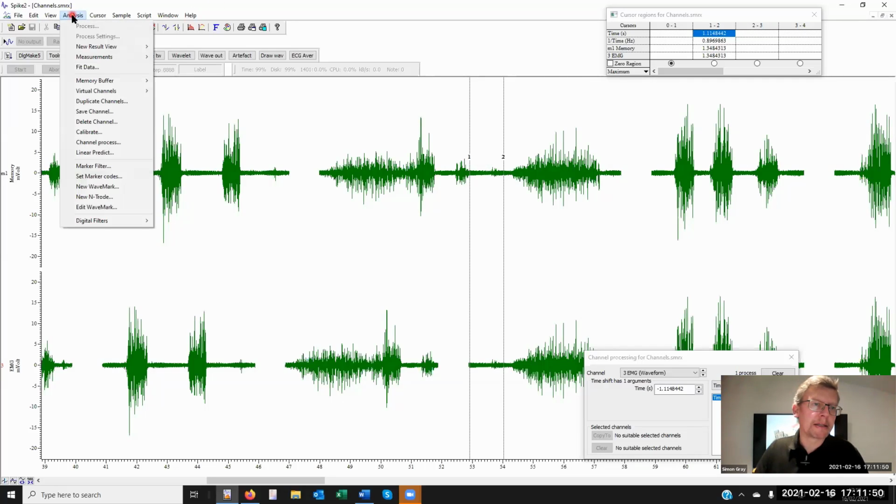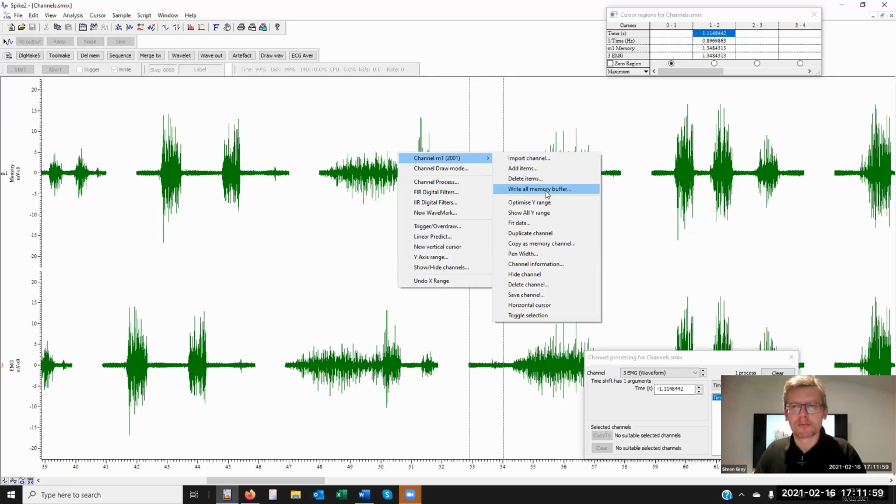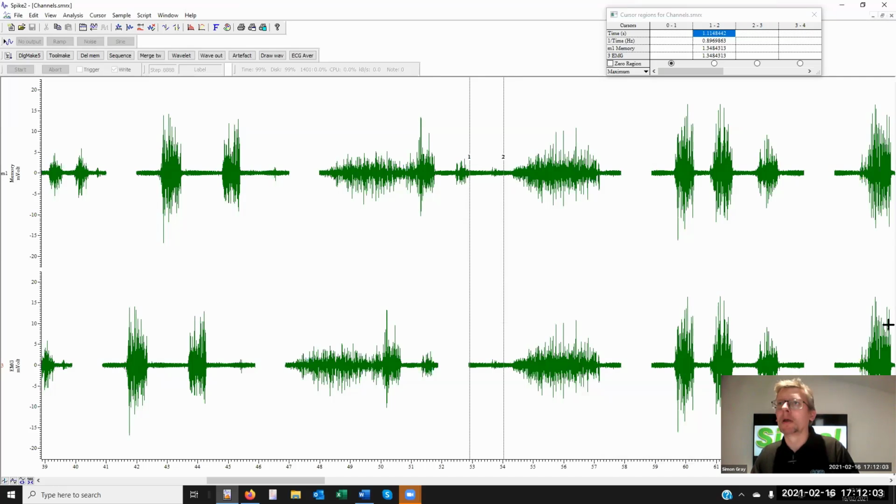Once again, analysis, memory buffer, write to channel, or right-click M1, write all memory buffer. Right.